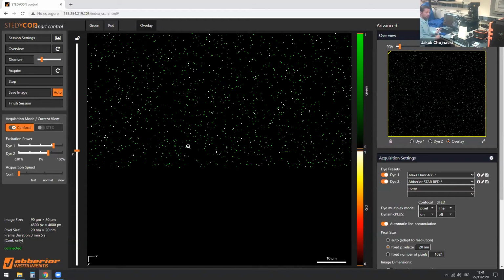Now, the first thing we have to do is put the sample on the microscope. So if you look at the camera, I am going to grab the sample. We're going to start with the HIV virus particle. I have several samples prepared here. Just so you know, when we study virus particles or any structures at very, very high resolution, in very, very high magnifications, we have to use oil.